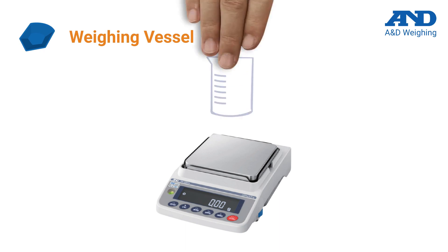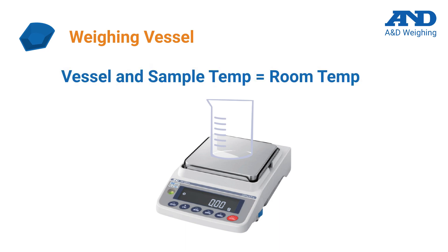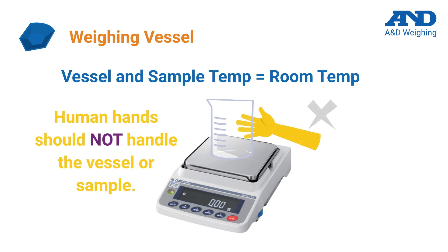Temperature stability is another important factor for precise weighing. The temperature of the weighing vessel and the sample it contains should be the same as the temperature inside the room. One way to ensure temperature stability is to not handle the vessel or sample by hand. Also, weighing should not be done immediately following vessel removal from a drying oven or dishwasher.